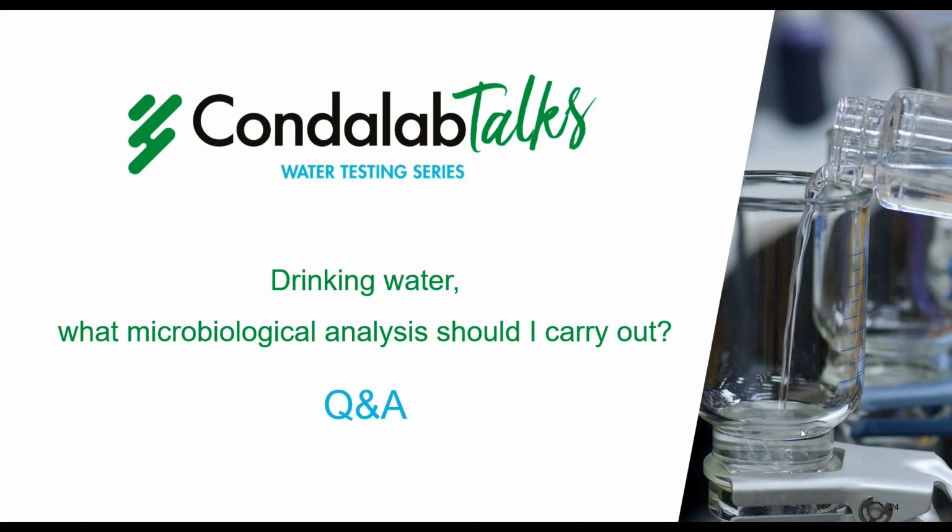In this case, when you observe growth at the edge of the membrane, surely it is a problem again of the vacuum not being done well, and therefore the filtration is not homogeneous. This can be partly due to a poor closing of the funnel or a failure of the vacuum apparatus. So you have to investigate what caused it and correct it, because this is not right. To do an analysis, it cannot be done.